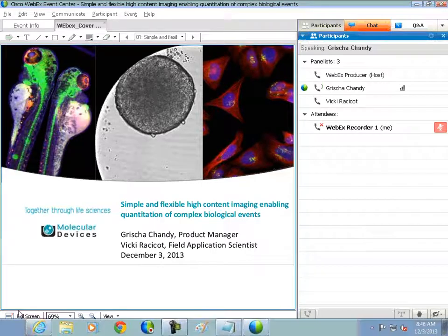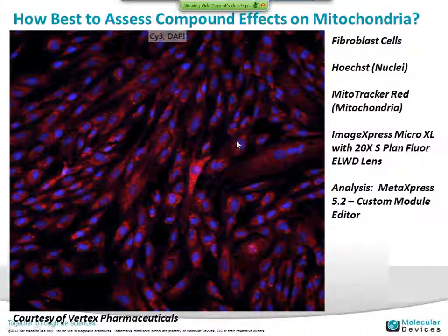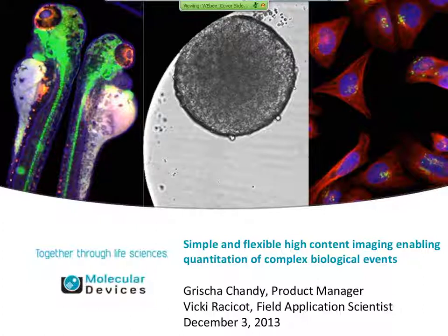Vicki, thanks so much for going through all that. That's quite a number of parameters you're pulling out of a couple of colors there of a biological assay. At this time, I'll just go back to discussing the hardware that those images can be acquired on. Vicki talked a little bit about MetaXpress, and then think about your questions to submit by the Q&A window for Vicki. So Vicki talked about MetaXpress and the new analysis capabilities in MetaXpress to generate custom modules.